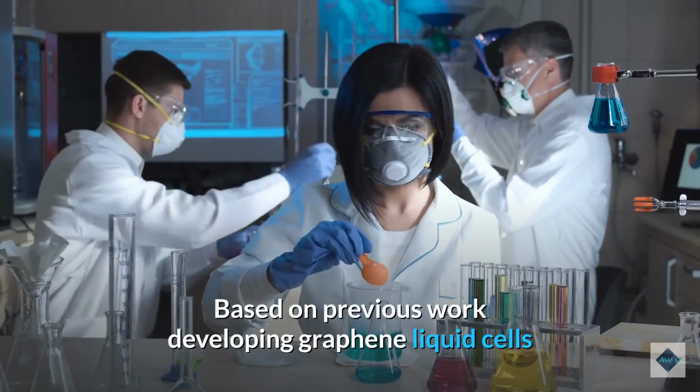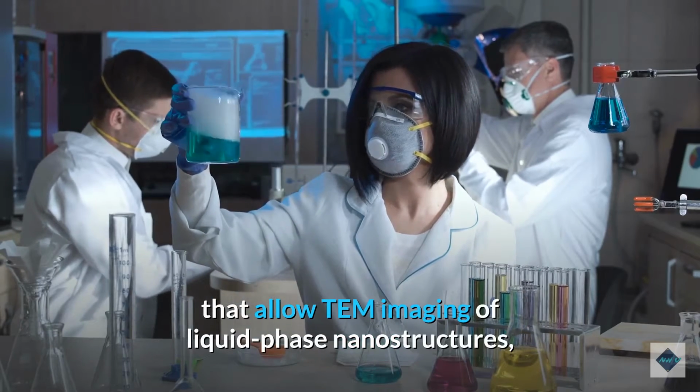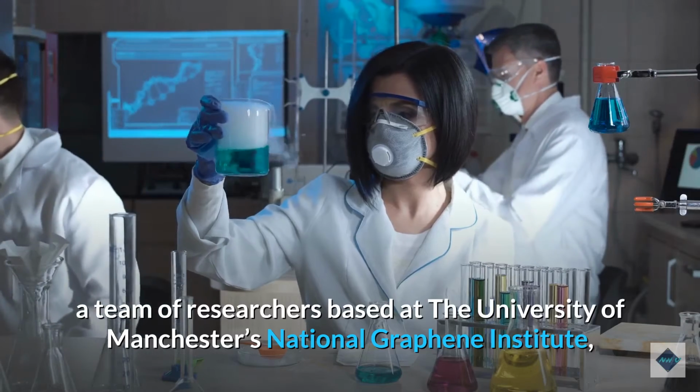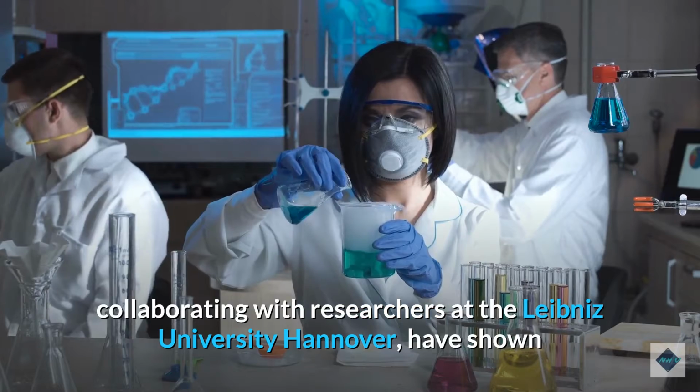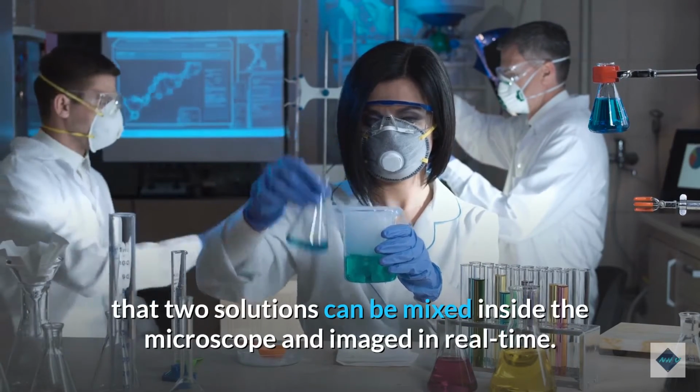Based on previous work developing graphene liquid cells that allowed TEM imaging of liquid phase nanostructures, a team of researchers based at the University of Manchester's National Graphene Institute, collaborating with researchers at the Leibniz University Hanover, have shown that two solutions can be mixed inside the microscope and imaged in real time.